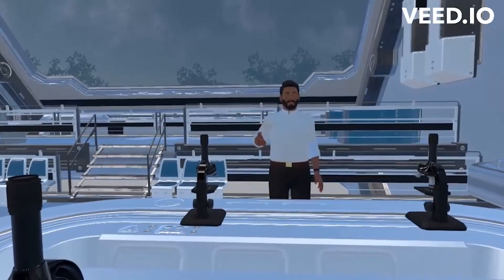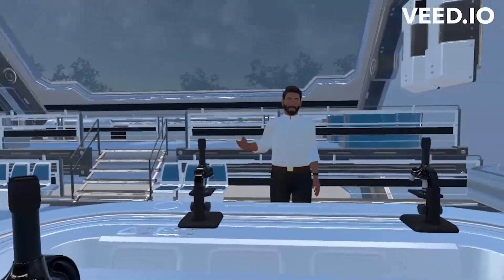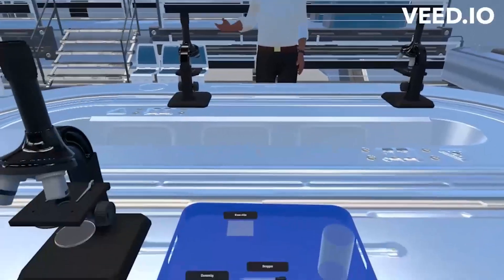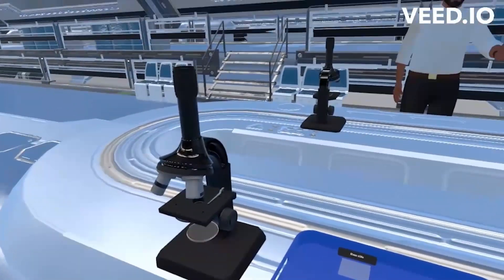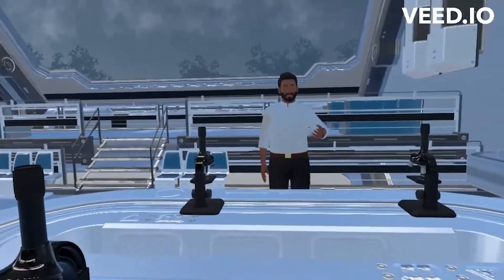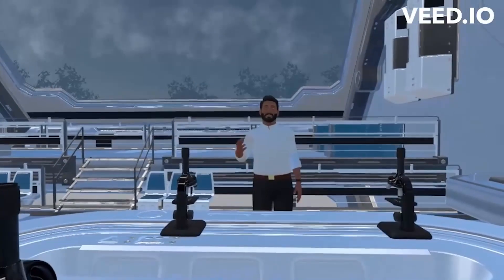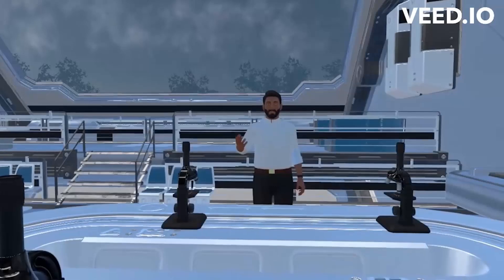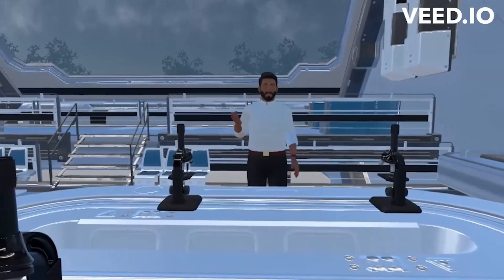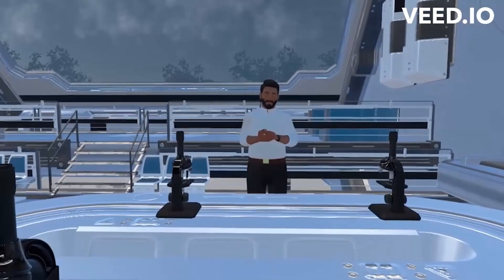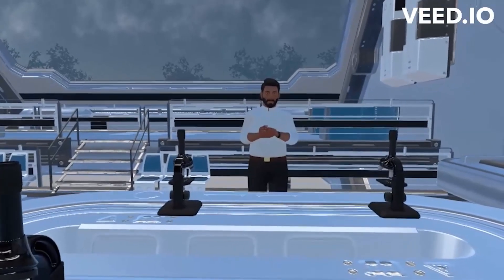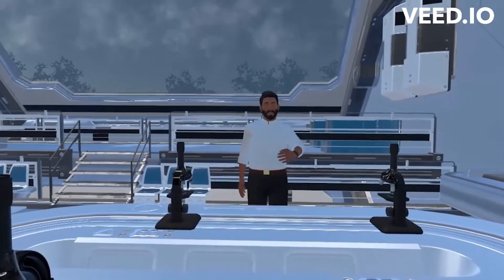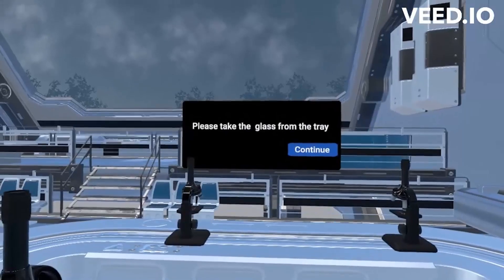Hello, dear science geek! My name is Micro Sleuth. Today we will embark on a fascinating journey into the microscopic world that lives beneath the serene surface of a pond. This pond water is a house of microorganisms bustling with activity. These microorganisms play essential roles in the pond's ecosystem. Let us reveal to you the hidden secrets of pond water.